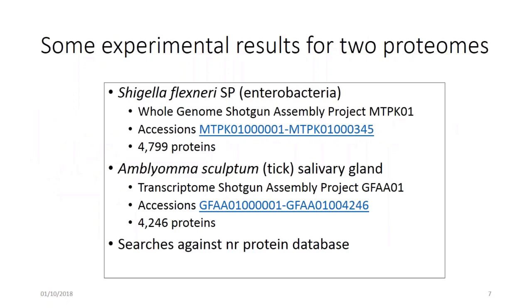So I'll just go over some results that Tom in the BLAST group presented at the NIH Research Festival recently. They are basically the kinds of things we're talking about, where they looked at a proteome from Shigella flexneri, 4,799 proteins from that genome.